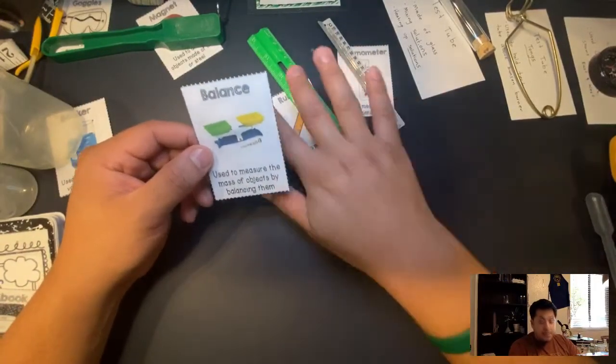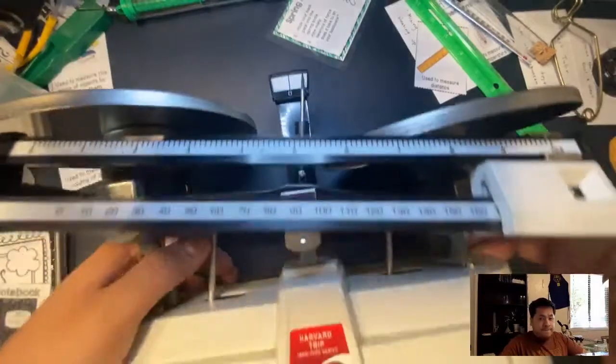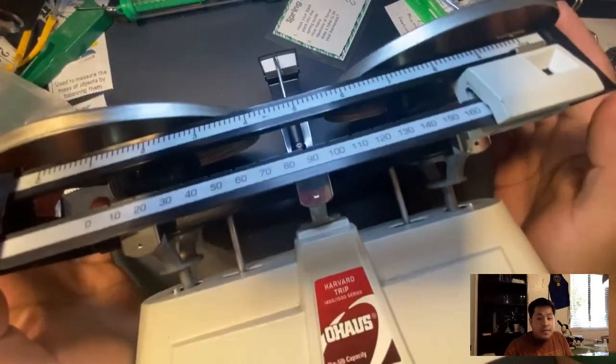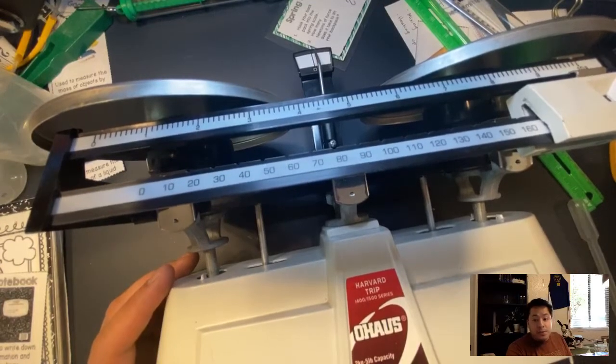Next we have a balance. It's pretty big so I'm bringing it over. A balance is used to measure weight. The units we're going to be using are grams and kilograms.